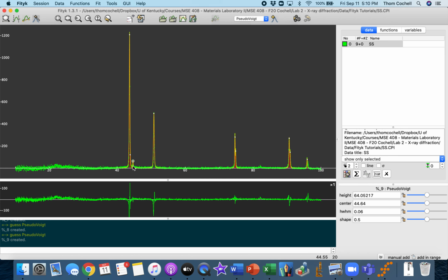Okay, so there, I was looking for it to add these last couple peaks out there. Oh, it added this one. That looks like a little peak as well. And then, yeah, there's that. I'm looking for that last one. So really anything above the baseline is what we're looking for. This area right here. Let me zoom into this.